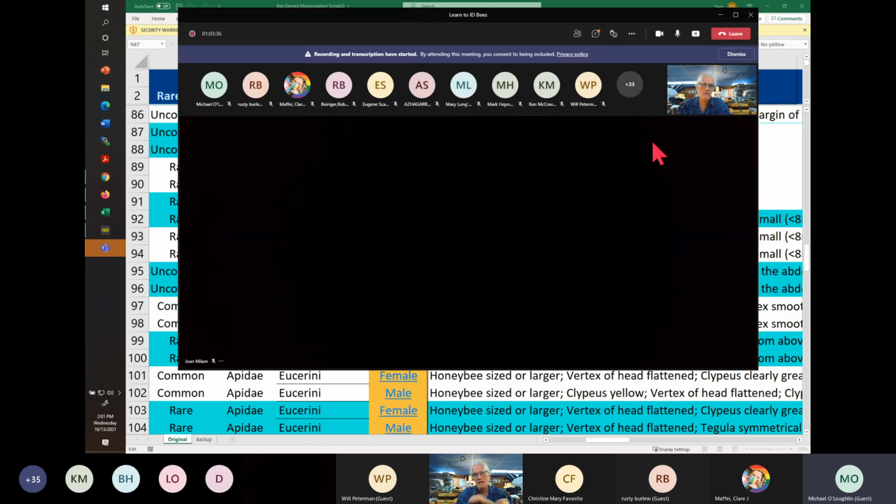And then you would literally take the point, which is already attached to the pin, and touch it to the specimen. So you would have the specimen on its back or on its side ready to be glued, usually on the back. And you'd come in and touch it, and that's all you would need. They're so light that you don't have to worry about them falling off.